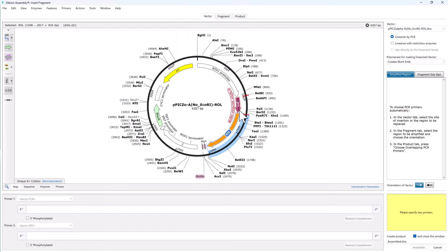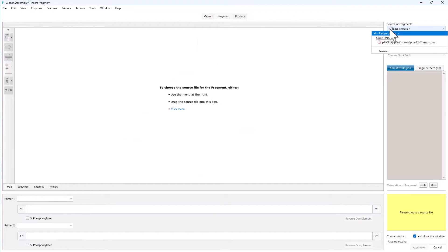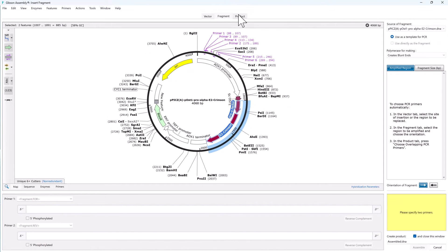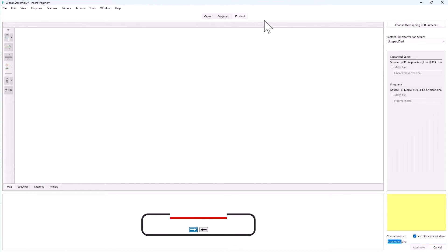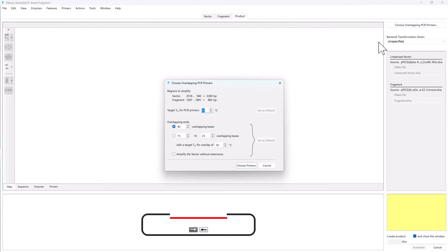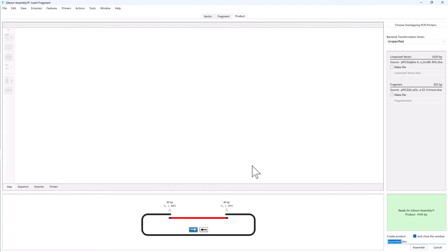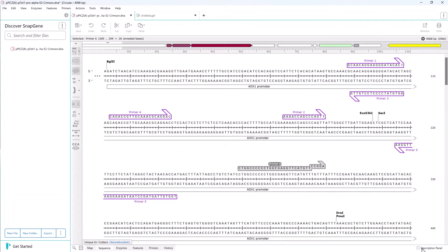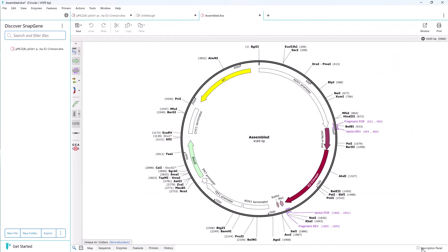Then select the insert sequence and define the region for assembly. In the product tab, have SnapGene design the primers required to create overlaps. Click assemble and that's it. We have our predicted Gibson assembly construct.